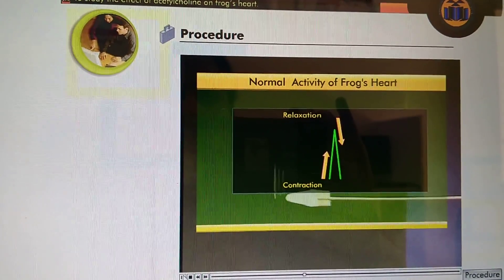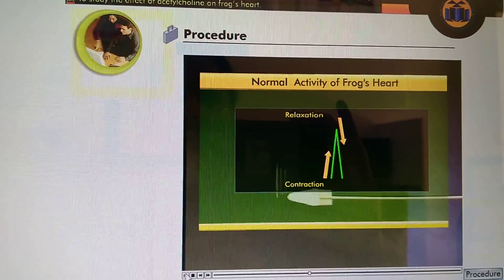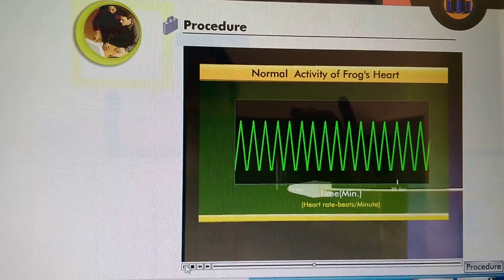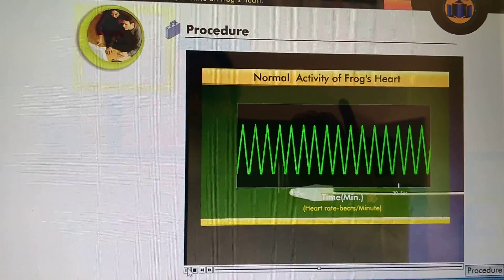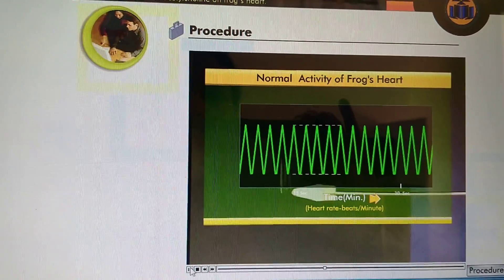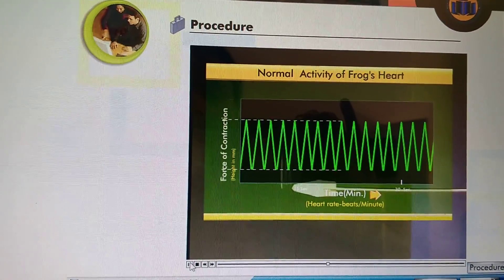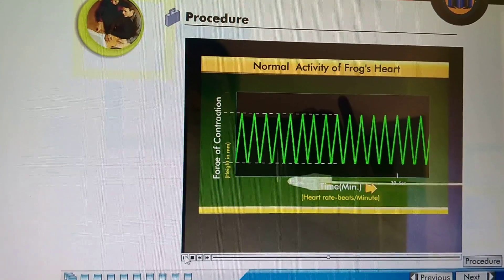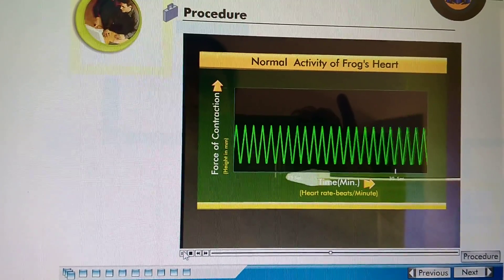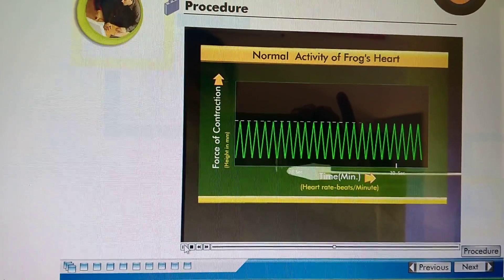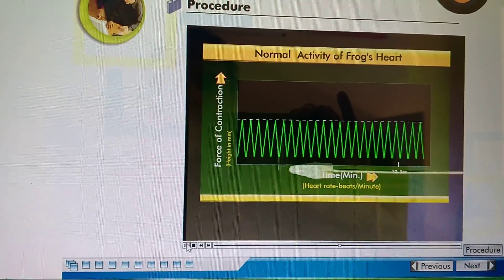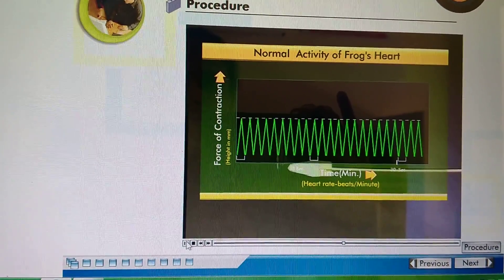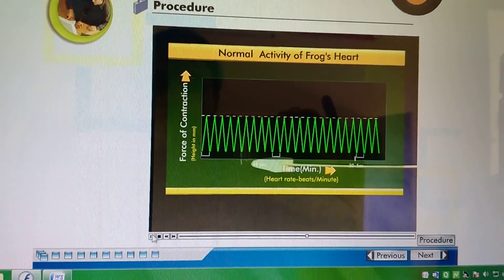In these tracings, the number of peaks per minute indicates the rate of contraction of the heart, whereas the height of a single peak indicates the force of contraction. You can see that all the peaks in the tracing are of the same height and at the same distance. This means contractions are rhythmic and with normal tone.